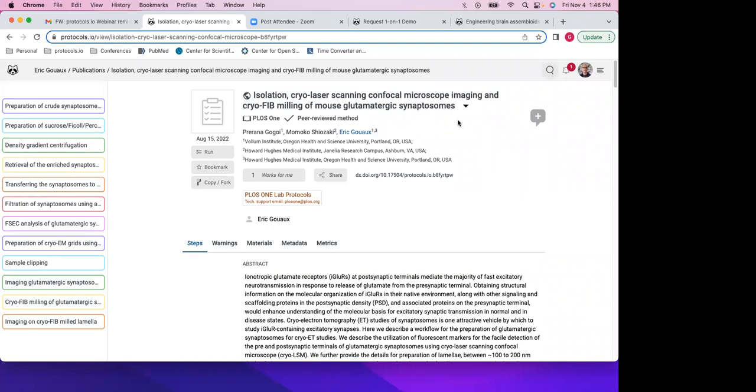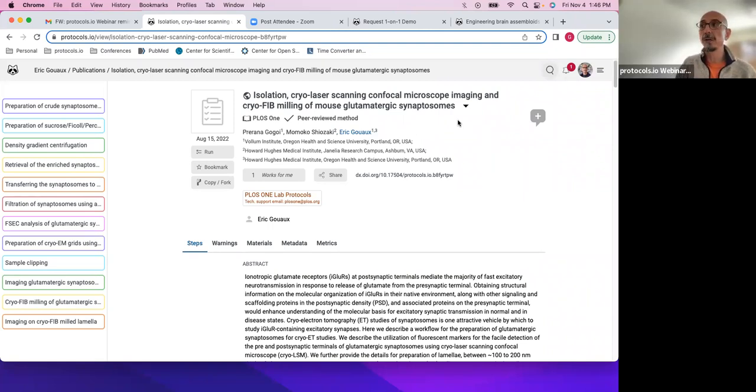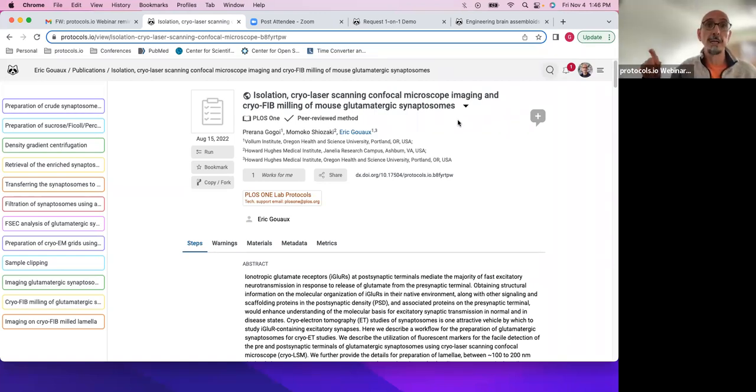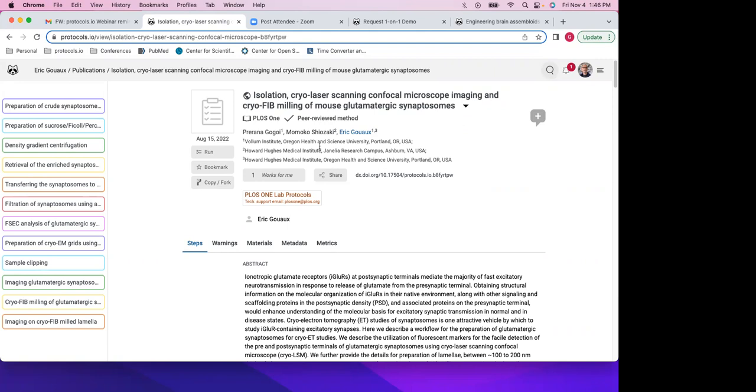Yeah. So I wrote down your suggestion, but also something that you can do is see if the protocol has comments, and you can also see how much the readers might be struggling using that specific protocol. But it's not as explicit as the button that you suggested. Nice. Yeah. Thank you very much.